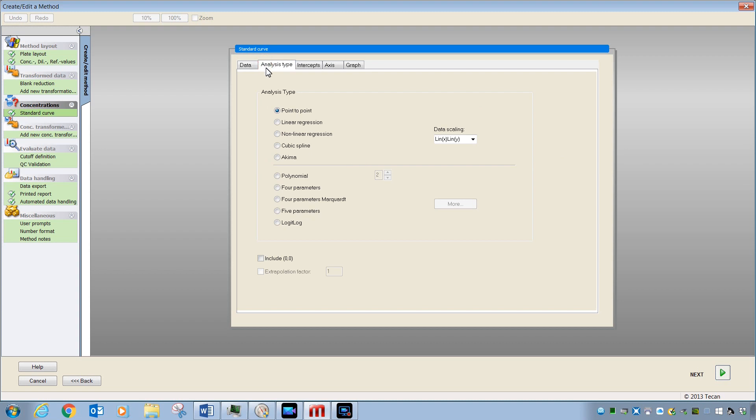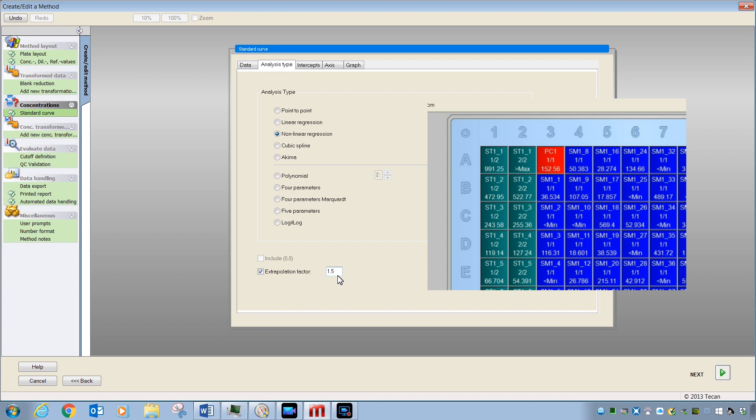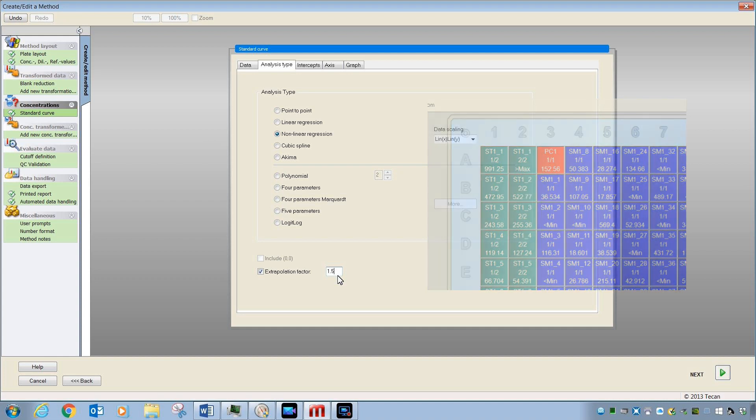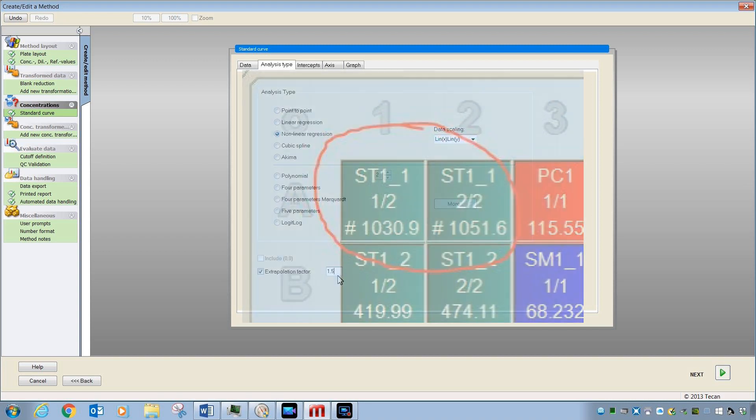Under the Analysis Type tab is where you pick the curve fit for your standards. Don't worry about getting this right here. You can always come back and change it. For this example, we will pick linear regression, and you should also note that there are some other features here that will come up depending on the curve fit you pick. For things like linear regression or nonlinear regression, you have the option of extrapolating the curve beyond the range of the high and low standard. Entering values here between 1 and 4 are usually sufficient, and when it is successful, you will see in your data display that concentrations that have been reported as less than minimum or greater than maximum because the curve could not determine their concentration, their concentration value will appear with a hash sign in front of it indicating that the concentration has been extrapolated.